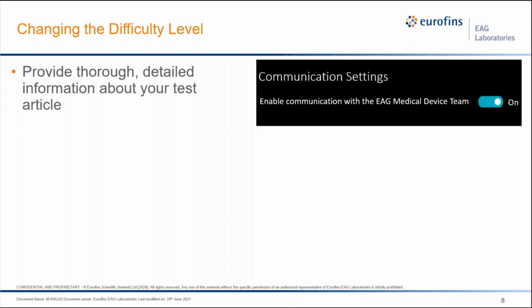Successful identification scientists are always trying to understand extracted compounds in the context of the test article as a whole. We try to relate the compounds we observe in the test article to rational sources based on the materials of construction and processing steps. ISO 10993 Part 18 guidelines emphasize the utility of information on the materials of construction and that it can and should be used to identify compounds in the extracts and to determine the likelihood of cohorts of concern being present. Providing EAG labs with information on how your device is made can turn a hard mode project into an easy mode project.